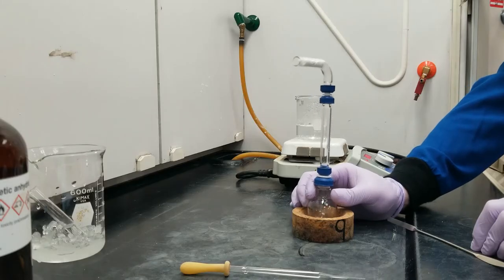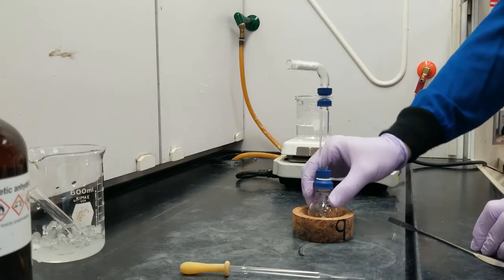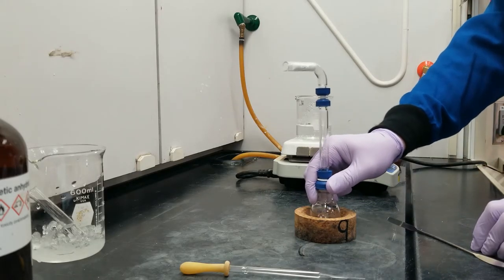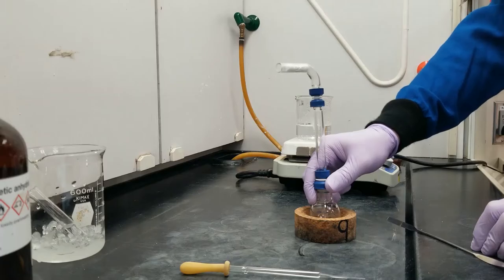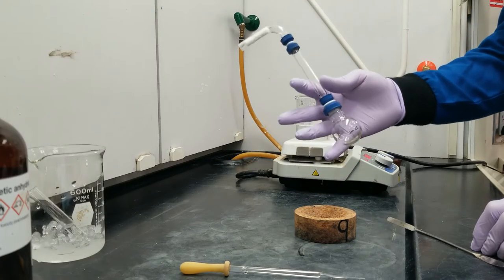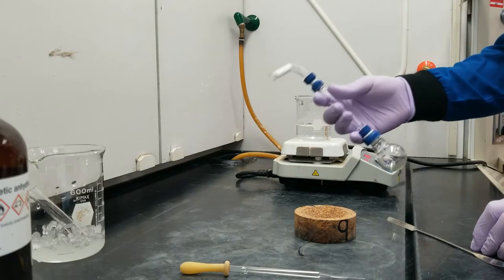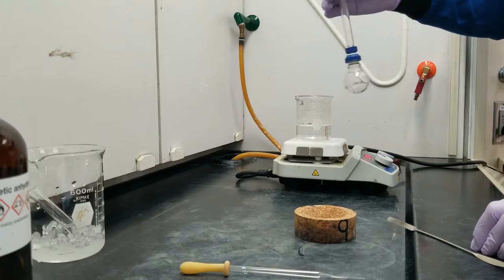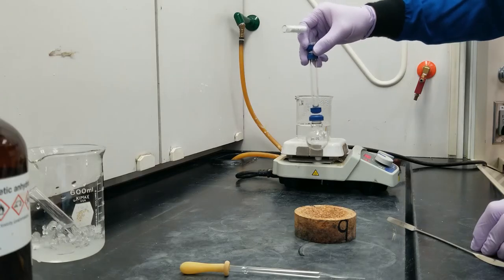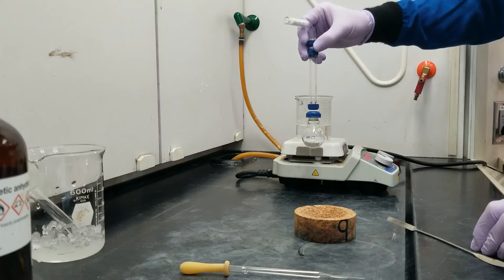In this lab, we're going to be acetylating ferrocene. Now, before I get into any of the compounds that we're going to be using, I want to start with our reaction setup, which I've got right here. What we're going to be doing in order to make the reaction happen is I'm going to take this whole reaction setup and swirl it in a boiling water bath.